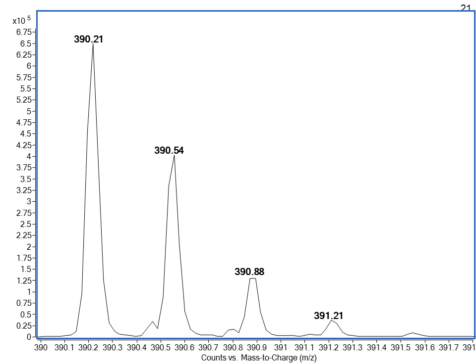So what about this one, another mass spectrum of a peptide? Here we see a difference of 0.33 or 0.34. As you can see, the third peak was not really acquired at the top, but that is typical of mass spectrometry because mass spectra are acquired at a certain rate, so it may not just hit the top of the peak in this case. Anyway, the difference is 0.33, so what is then the charge state of this ion? It's simple. 1 divided by 0.33, or 1 divided by 1/3, means that the charge state is 3.